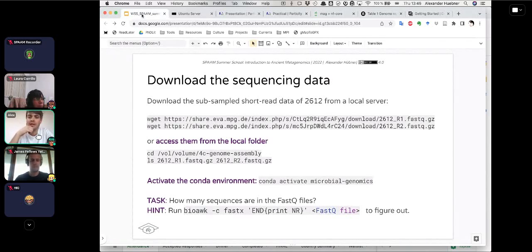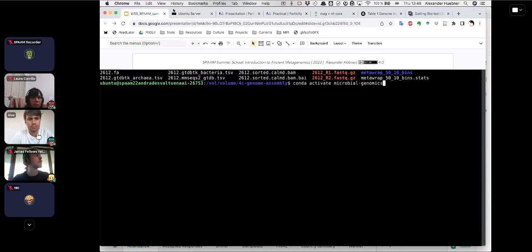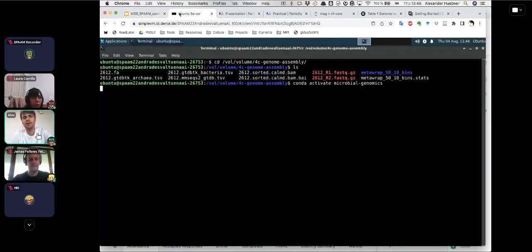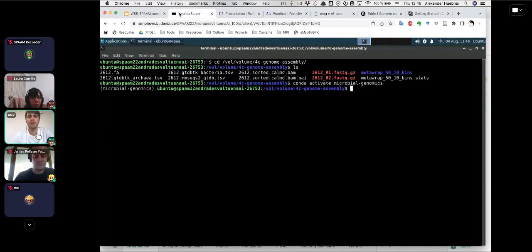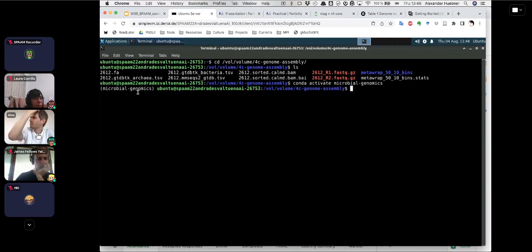The next step is to activate the conda environment. We use the same conda environment as this morning, called microbial-genomics. If you already have it activated, you don't have to do it again. When this command is successful, you should have 'microbial-genomics' in parentheses at the left-hand side of your terminal line. If that doesn't work for anyone, please let us know in the chat window.